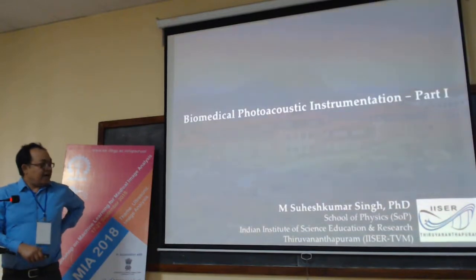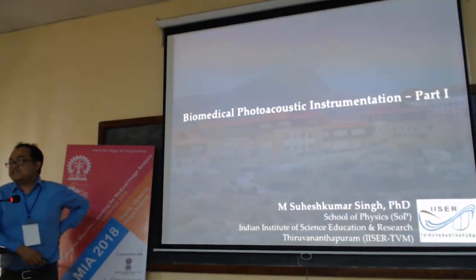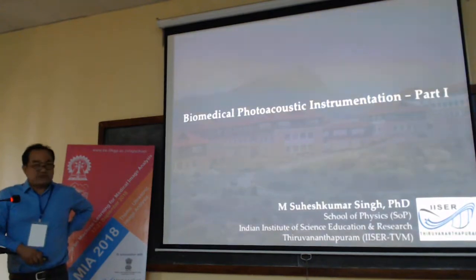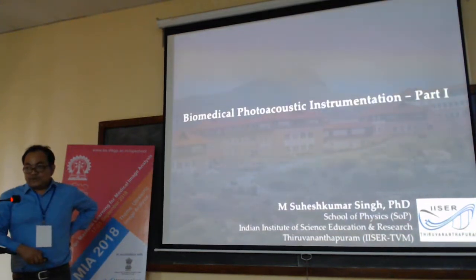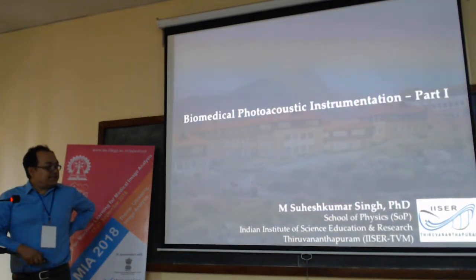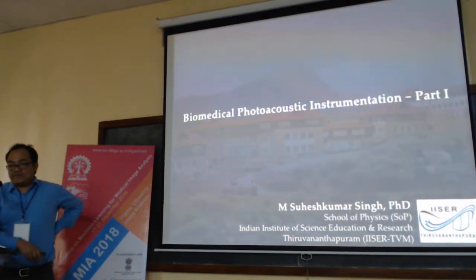So, yes, I have seen in the schedule of this workshop, a lot of people have already talked about the physics and the algorithms and the prospect of photoacoustic imaging systems. Now, I will focus more on the instrumentation part, design and development, and the processing and all these things. To come in that way, I would need to browse back the very physics of the phenomena.